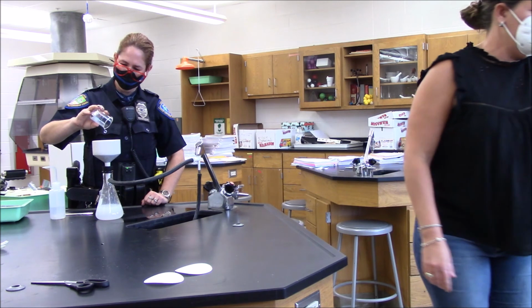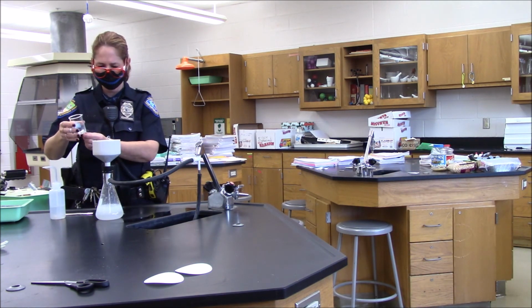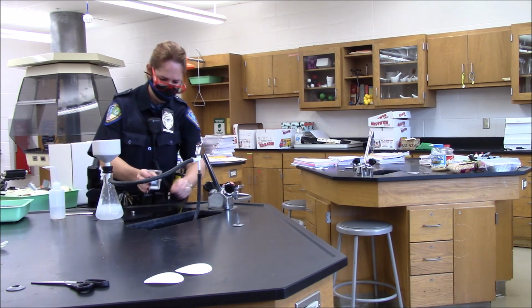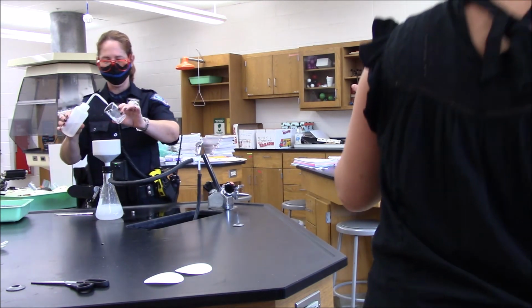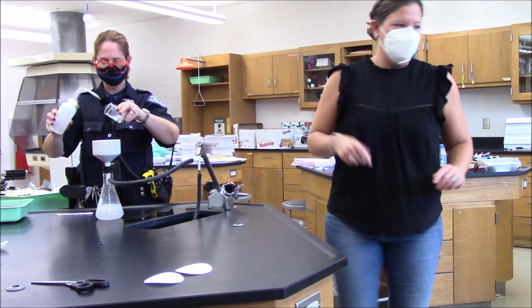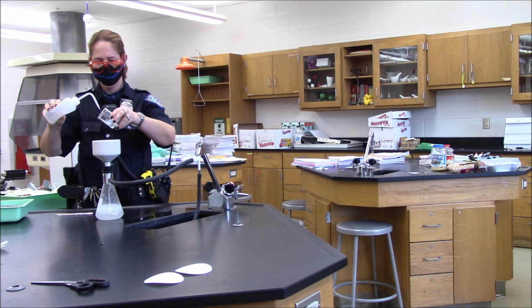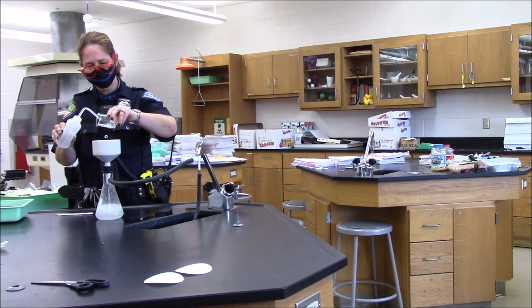Now you can rinse out your beaker. Hold on, just keep that on, and then you don't have to worry about the stir bar coming out. Rinse this and pour it back in to get all that good stuff down there. Yep.